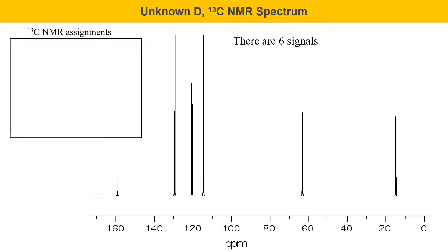Here's the carbon-13 NMR spectrum for unknown D, and this one is a fairly low resolution spectrum, so I'll just tell you that there are six signals here. Each one of these is a single peak, and that means there are six unique carbon types in this molecule, and you need to figure out what they are. One of the things that's interesting is this peak near 160. It's kind of at the border of a couple of different regions, so you should keep that in mind when you're looking at your tables of carbon-13 NMR data.